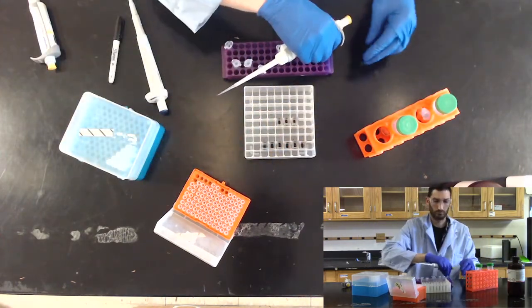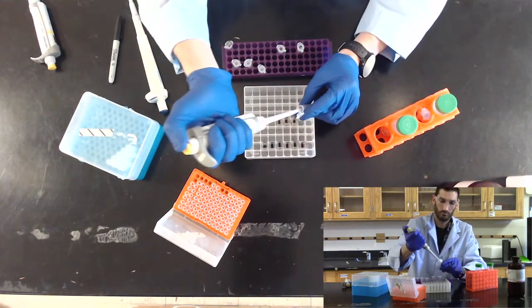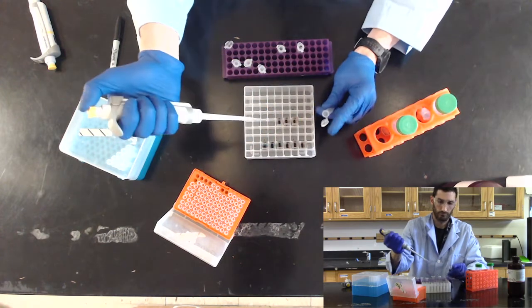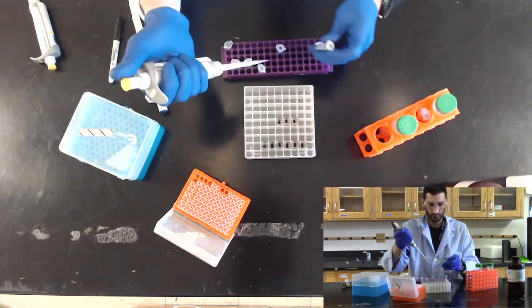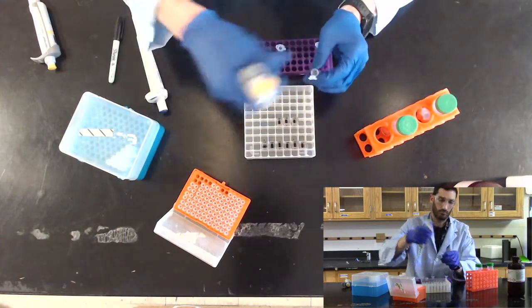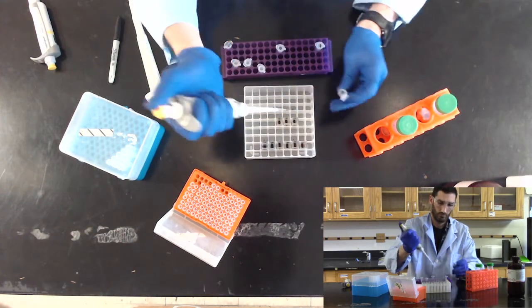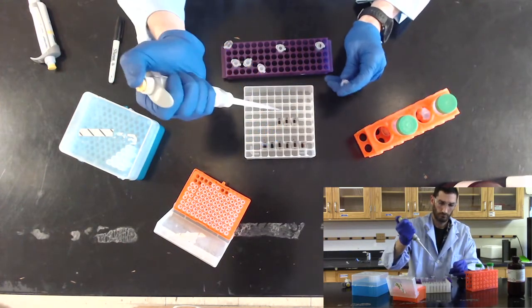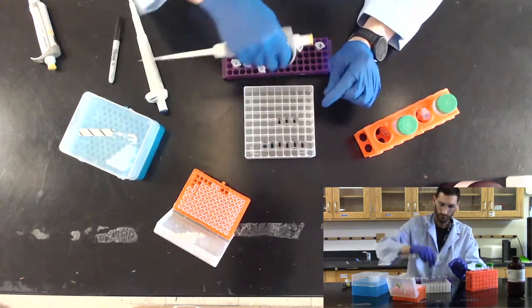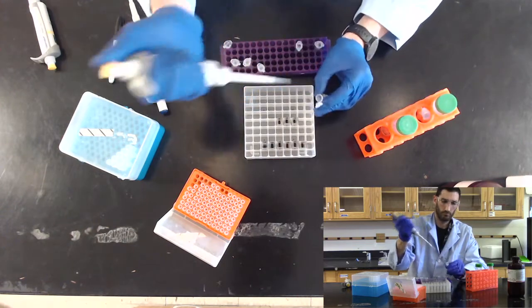Next, add 20 microliters of your 1X, your 5X, and your 10X purified protein to the remaining 3 cuvettes.